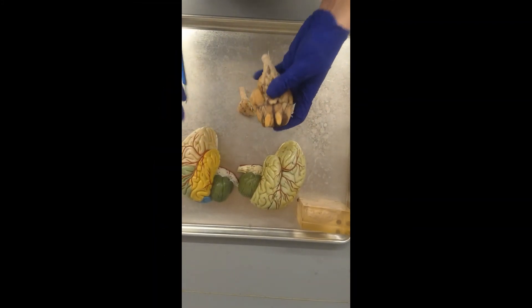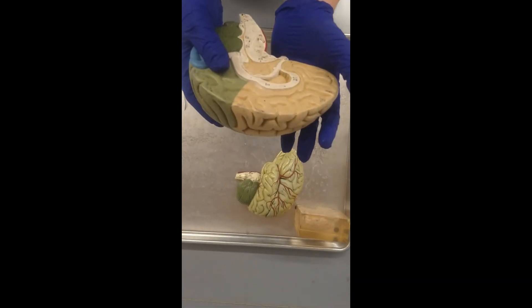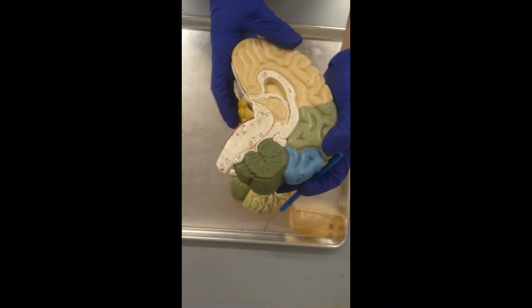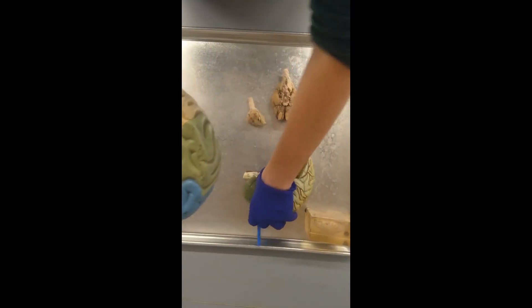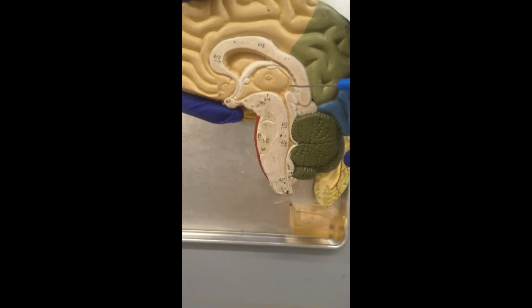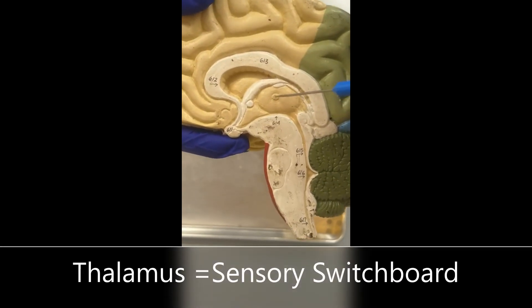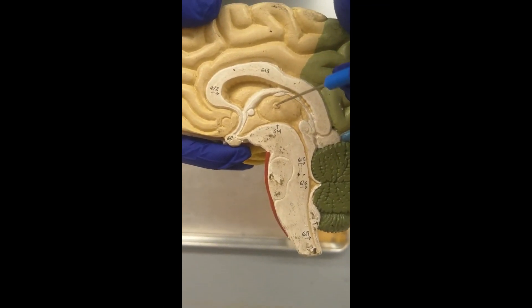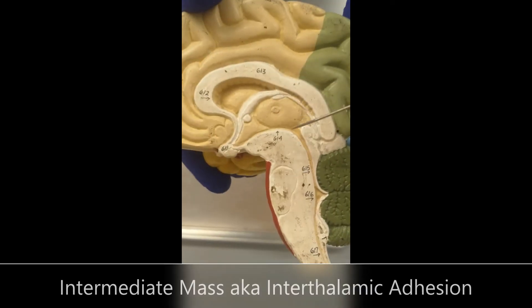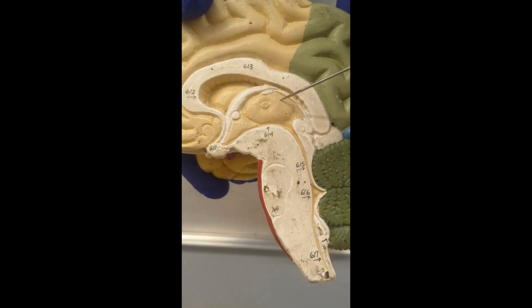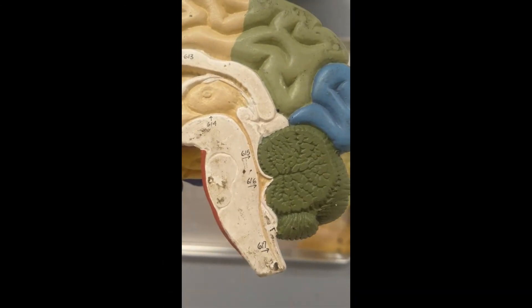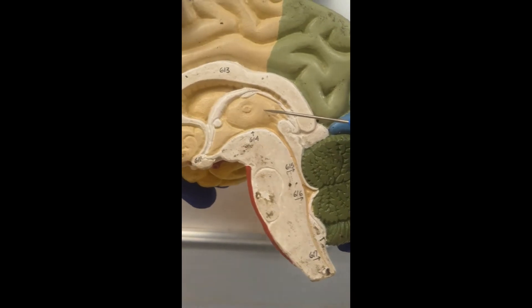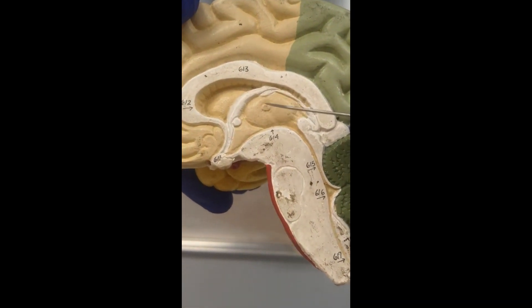That's the external structures of the diencephalon. For internal structures, we're going to look at the thalamus, the hypothalamus, and the epithalamus. The thalamus is this whole structure right here, and on it there's this little tiny dot — this actually connects the thalamus on both hemispheres. It's called the intermediate mass or interthalamic adhesion. The thalamus is like a sensory switchboard, relaying impulses traveling to and from the brainstem, spinal cord, cerebrum, and cerebellum.